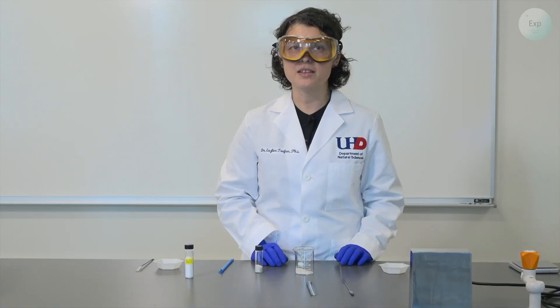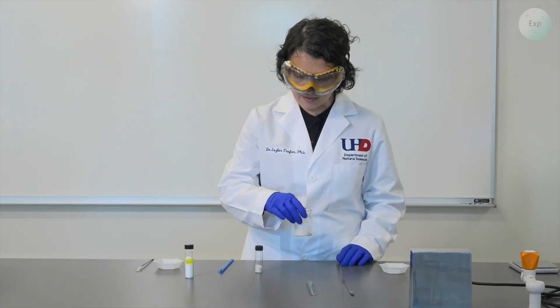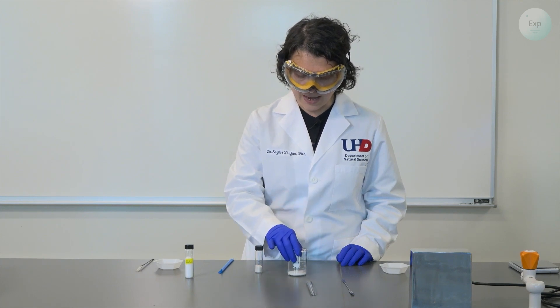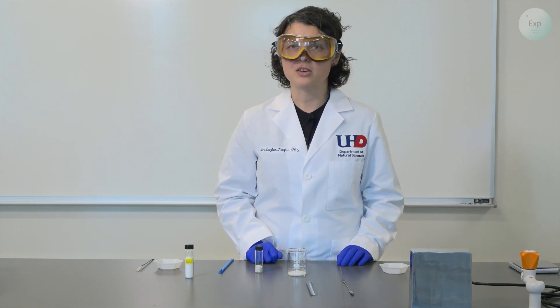When I am satisfied with the transfer, I can give it a swirl, making sure that nothing comes out of the beaker, and I will consider my heterogeneous mixture with two substances concluded.